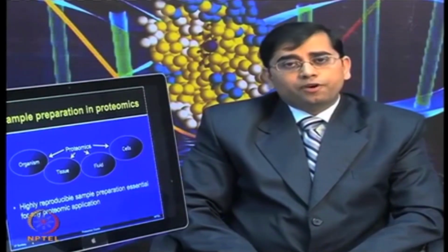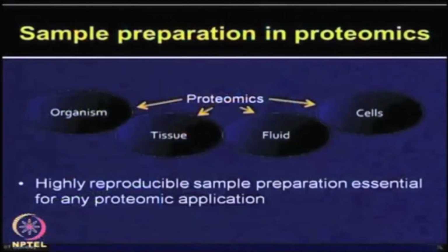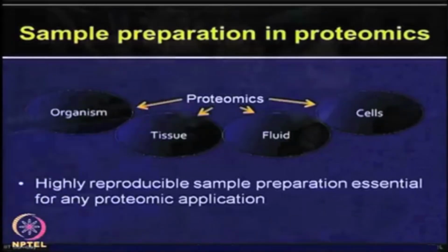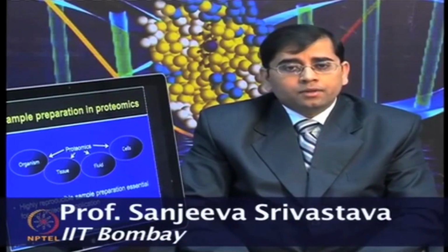Whether you want to perform your proteomic analysis for the whole organism, which means you want to know all the proteins present in a given organism or in a tissue or in body fluids or in different types of cells, proteomics can be global or it can be very targeted or expression based. So, highly reproducible samples are very important for performing comparative proteomic analysis.